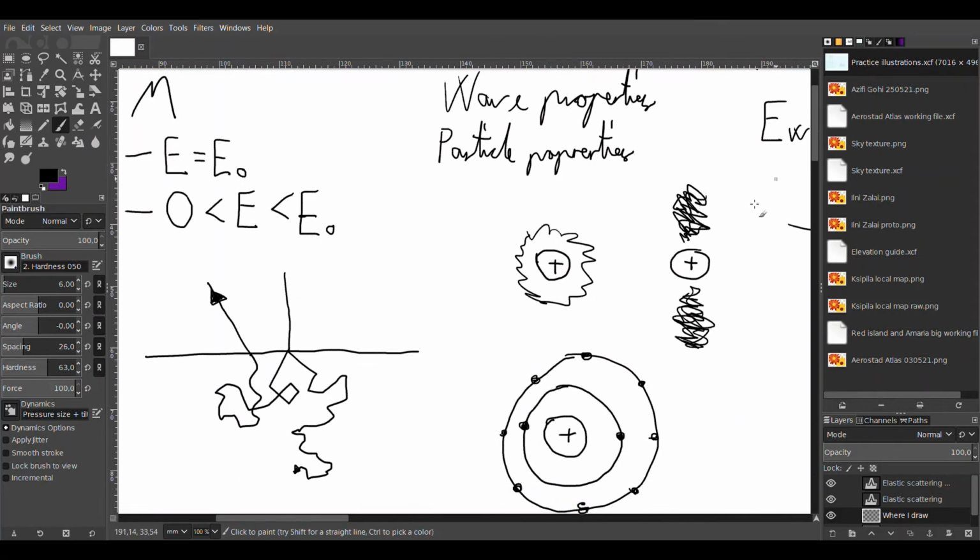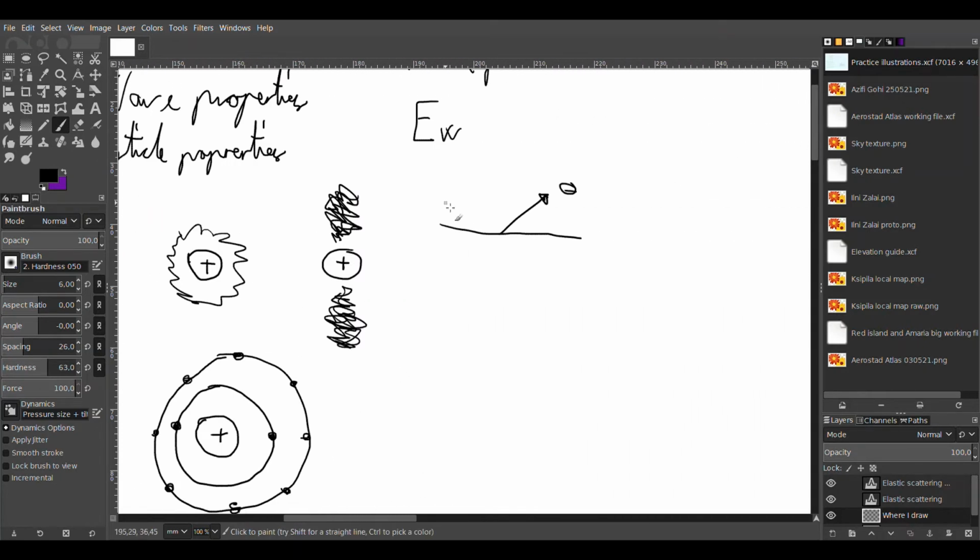Because this electron, to be able to scatter back, it needs some energy. So the electrons have gotten down into the material, some dissipate into it, it goes deeper and deeper, it doesn't find its way out. And this here, it's found its way out and it shoots off into space or into a detector or into the laboratory somewhere. But it's not in the material any longer. So it's escaped the material. So work function, you can see as a kind of escape velocity or escape energy.